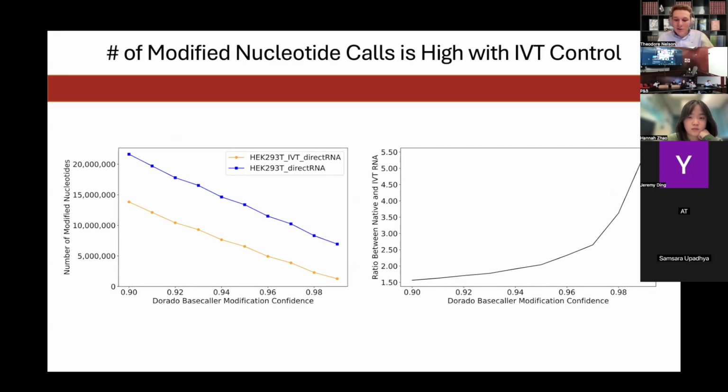But at the end of the day, if you increase the coverage stringency, if you required each site that you wanted to call to have 1,000 reads, you're going to call very few sites. You're going to lose a ton of your data within the transcriptome. With 20 reads, you're already losing a lot of sites that might have less coverage than 20 reads. So calibrating the number of reads and the coverage you're going to use to call a stoichiometry is itself a numbers game and an important step.